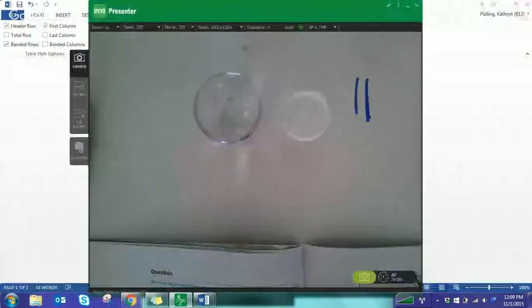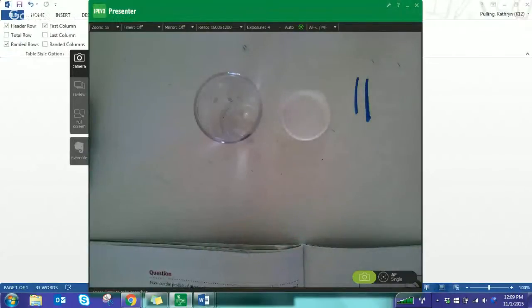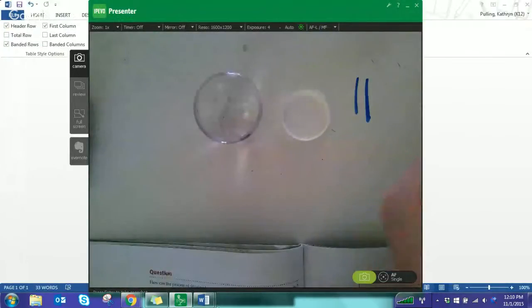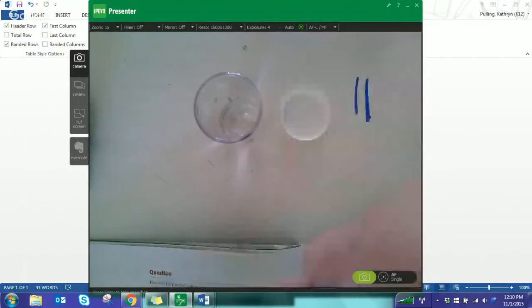for phenolphthalein. So to double check and make sure that I haven't goofed anything up, there are pH strips, right, in your kit. And it says use pH paper to check that the pH of the sample is 8.3. On the bag of your pH strips, there's some instructions for doing this. It says dip test strip in the solution for 3 seconds so all color zones are immersed. Compare unprinted indicator zone to color scale and determine the pH value. Okay, so the zone we're going to be looking at is this one, the one that doesn't have a number on it.